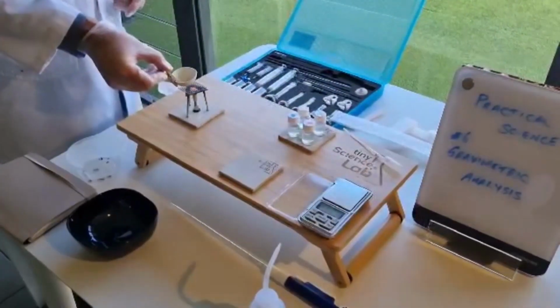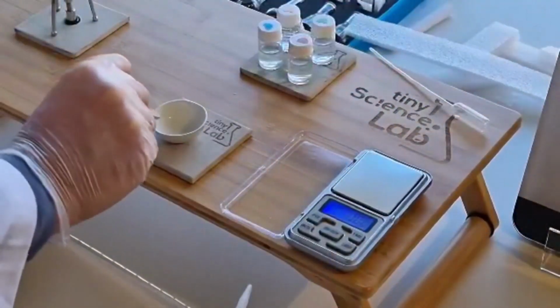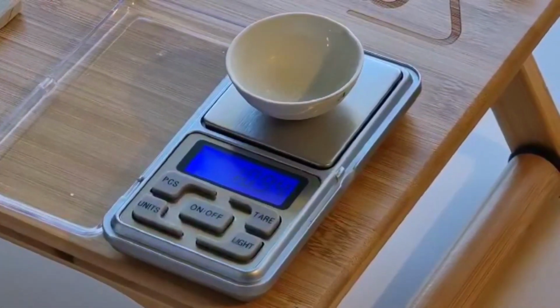So that's Kingsley Beach and it's now done. So let's weigh that one too. So Kingsley Beach, and that one's coming up 10.94. So we've got 1 left.